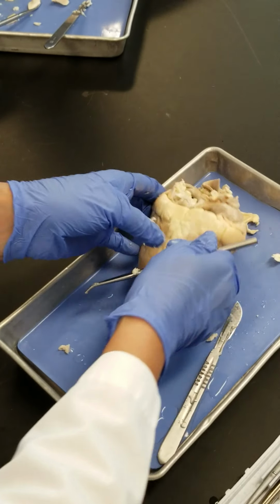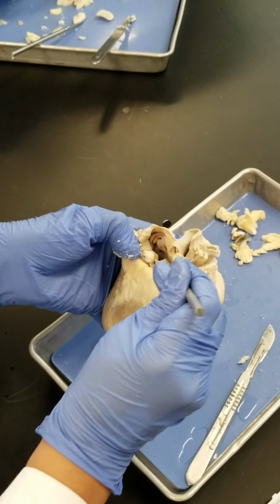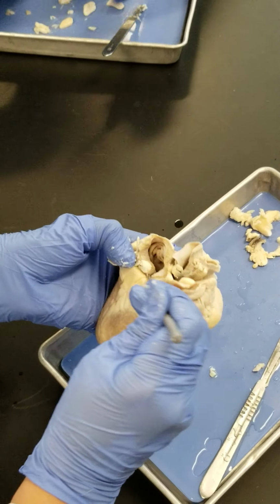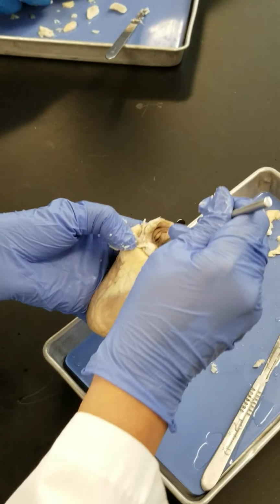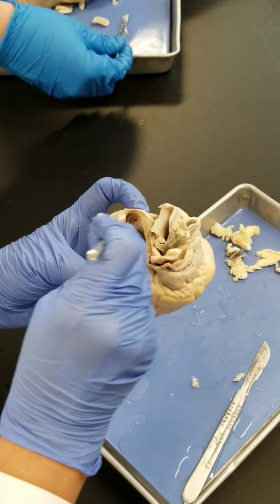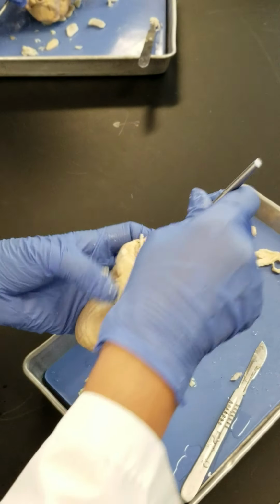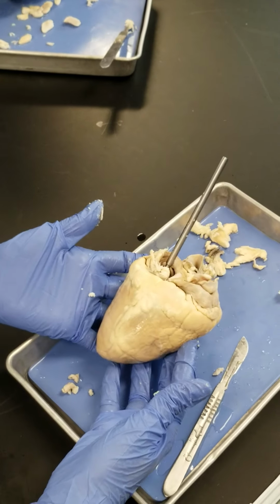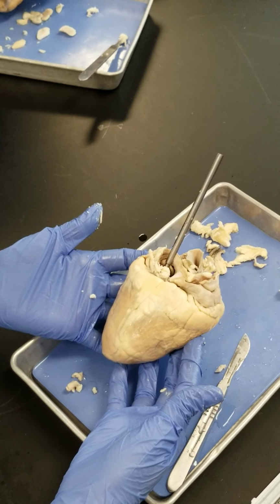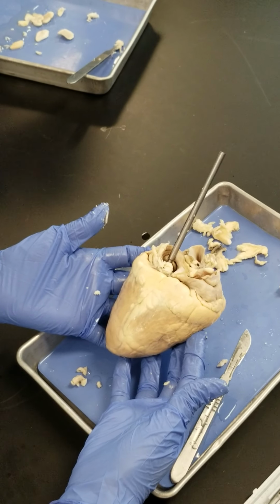Let's see what we have here. You don't have the vessels, you have the whole chamber, just the left atrium, with the four pulmonary veins going into that one, right? Good? And take a picture. Okay. So that was all the things about the outside of the heart.